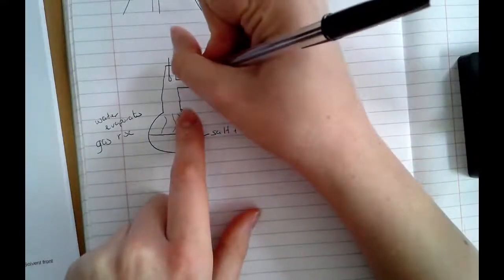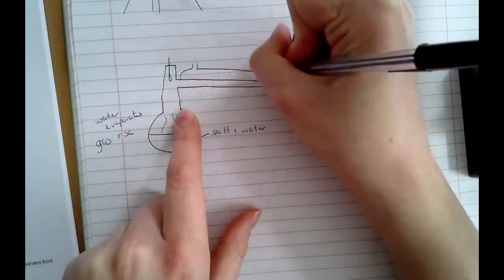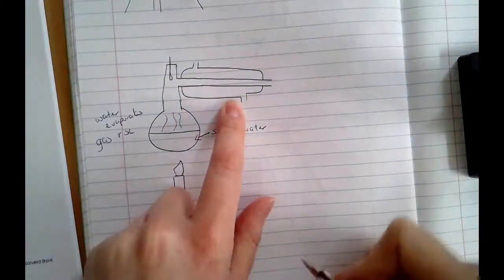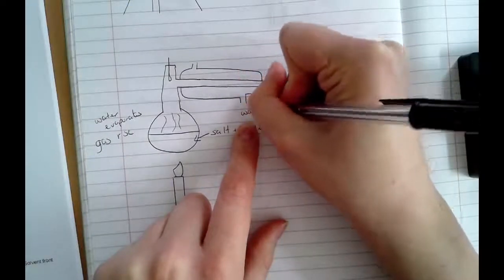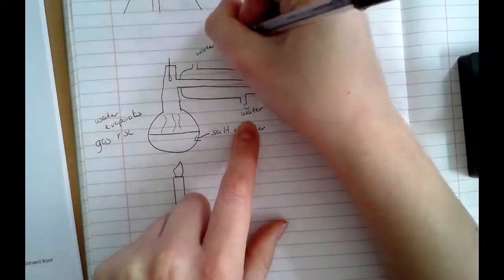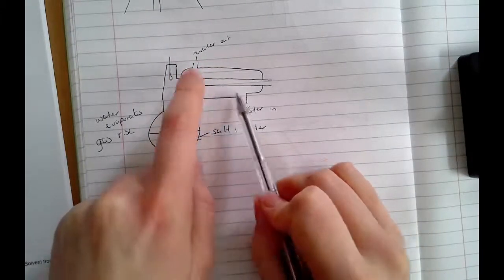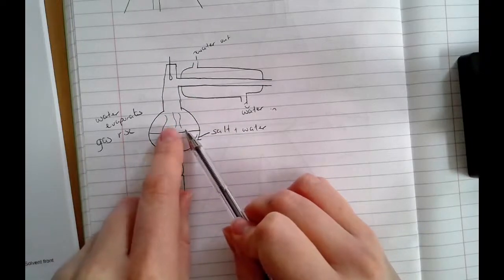So what you've got flowing around your condenser is you connect your condenser to the tap and you have cold water flowing around your condenser. You've got water going in at the bottom and that water comes out at the top. Now this tap water is purely to keep your condenser cold. The water from the tap does not mix with the water from your experiment.